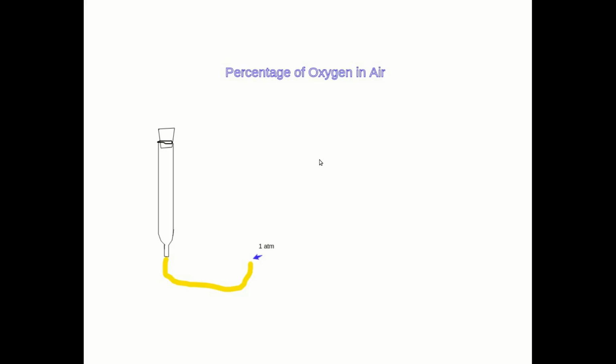Hi, this is Justin from Chem 2070, and I want to talk about today's experiment and how to use today's data to calculate the percentage of oxygen in air.